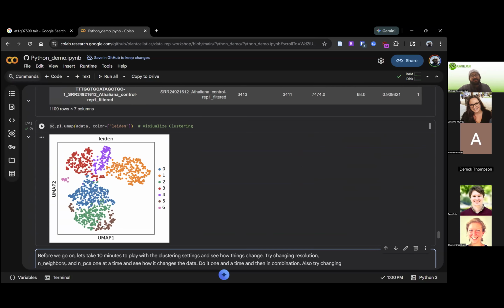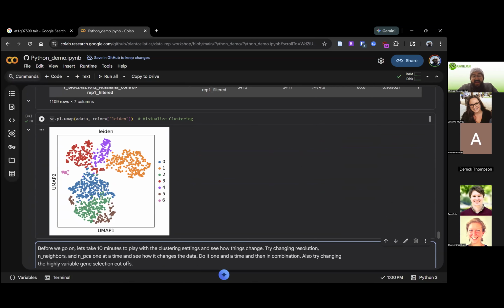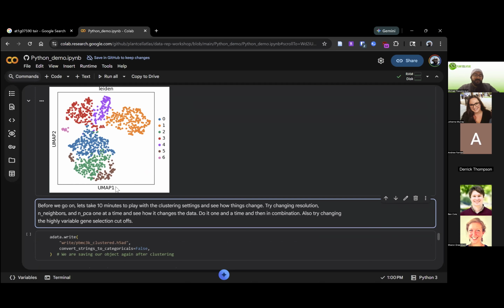So here's our UMAP, our 2D space. You can see that we have a couple of clusters identified. The reason I picked this specific clustering is because it highlights how the clustering happens in a multidimensional space. You have these brown cells here and here assigned to the same cluster, even though they're separate in the UMAP. That's because UMAP is not a true rendition of the high dimensional space. These are closer to each other than they are to these green cells, even though in the UMAP they look closer to the green cells. That's a great example of why you can't measure distances in UMAPs.